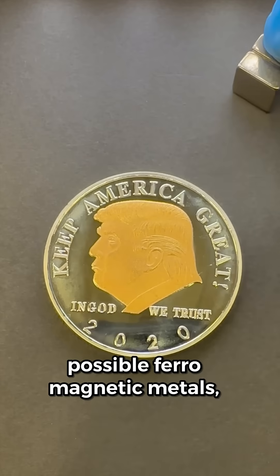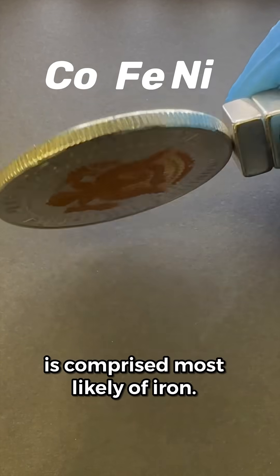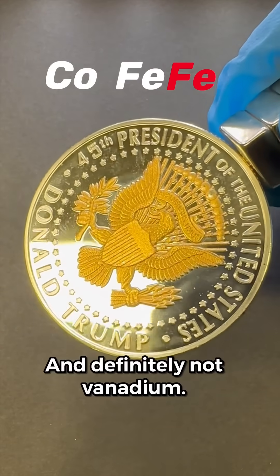So of the three possible ferromagnetic metals — cobalt, iron, and nickel — this token is comprised most likely of iron. Definitely not vanadium.